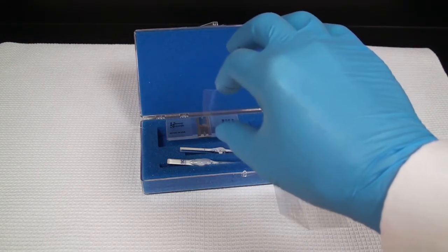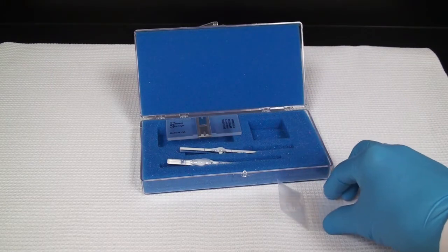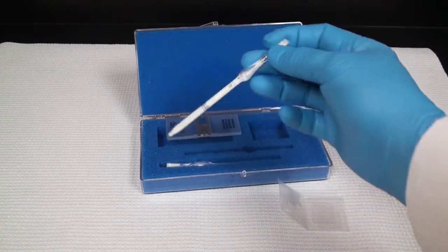This coverslip is special — it's a little bit heavier than a regular coverslip so the surface tension of the water doesn't float it, so you don't use a regular coverslip.